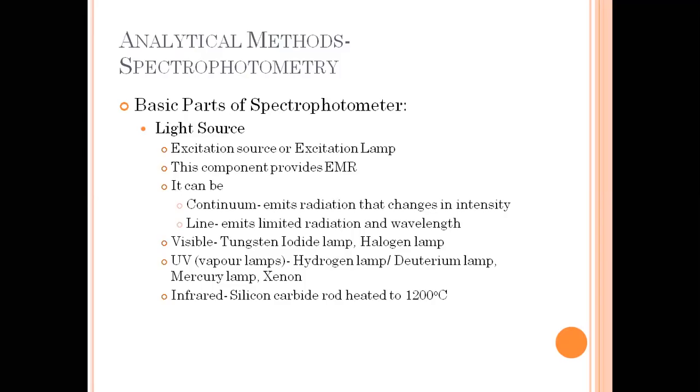So depende sa wavelength na gusto mong gamitin, okay, yung magiging light source mo. Kasi iba-ibang light source, iba-ibang type ng light source can produce a different range of wavelength. Okay, so kindly take note of this different light source that can be used depending on the wavelength needed for the measurement or for the spectrophotometer.